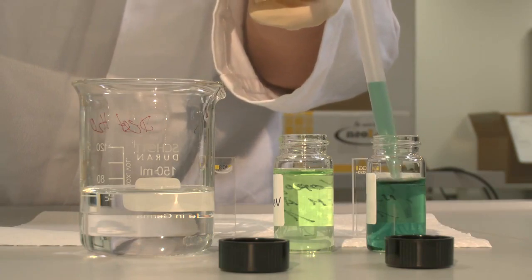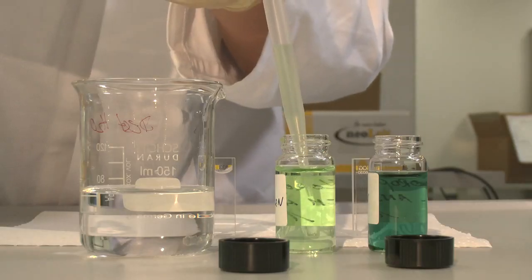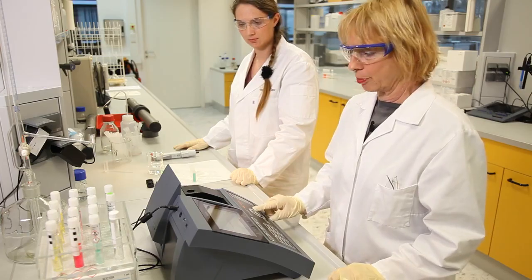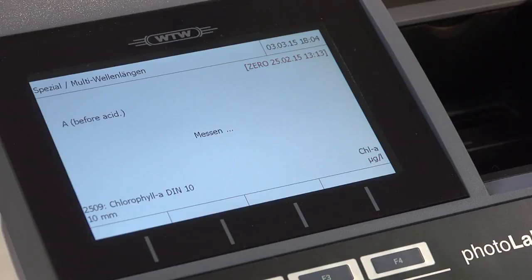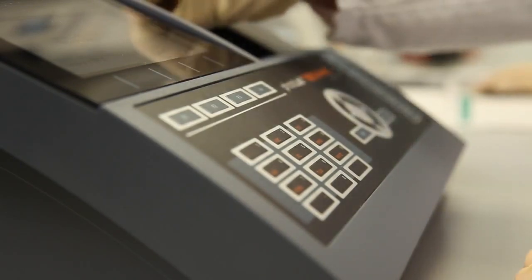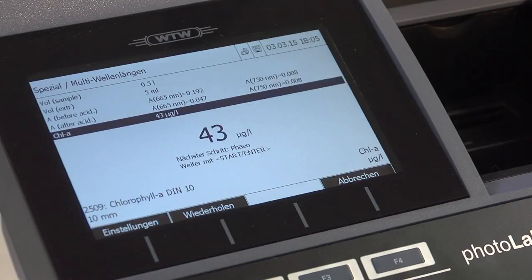Using chlorophyll as an example, I will show that photometers can also be used for multi-step application measurements. We are going to measure a chlorophyll sample directly after extraction and after the pH has been changed by acidifying the sample. First, we enter the total volume of the sample and then the volume of the extraction — 5 milliliters. We take a reading of the chlorophyll sample from the direct extract, and after acidification we take another reading. The ratio of the two absorbance values is used to calculate the total amount of chlorophyll.